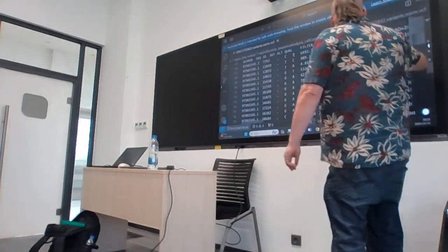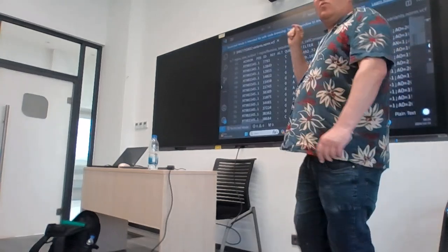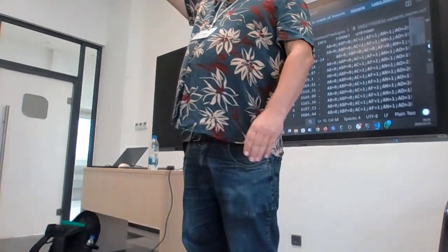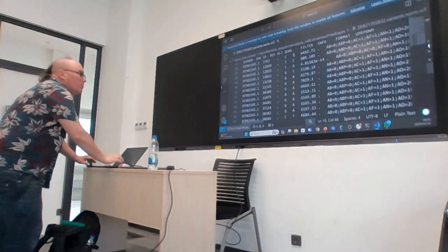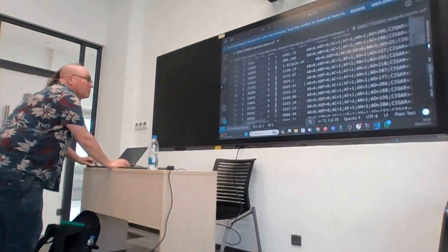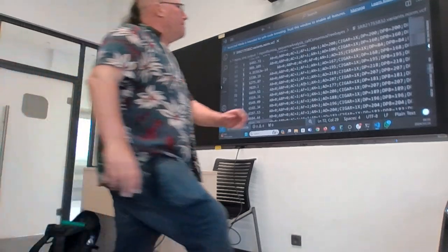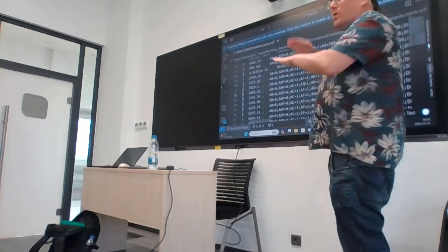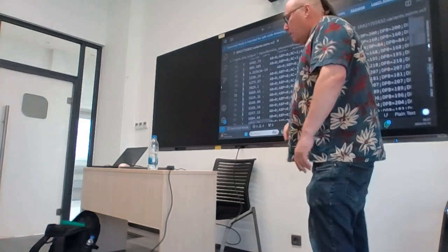I want to highlight this thing, AF, allele fraction, okay. So remember in the picture that there's many reads that are mapping to this position, okay. I'm just going to scroll a bit sideways so you can see something else. Depth is depth of reads, okay. How many reads are at this position? 200. DP is depth, okay?